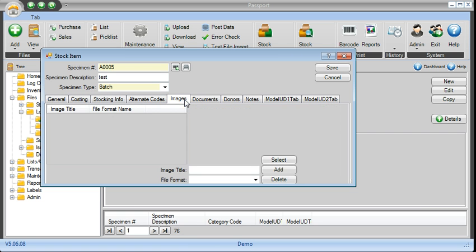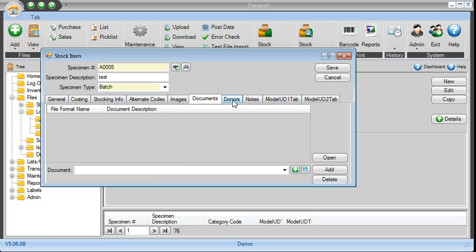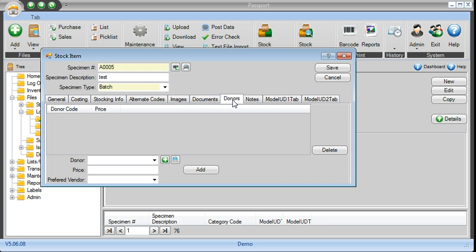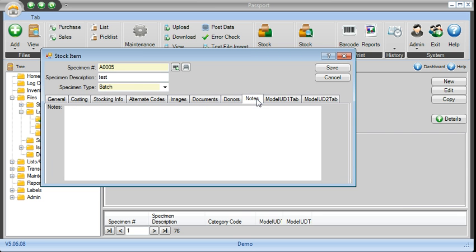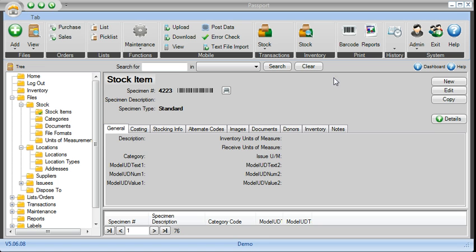At this point, you can upload images, documentation, associate the donors with these items, some notes, and hit save, and your items are pre-populated.